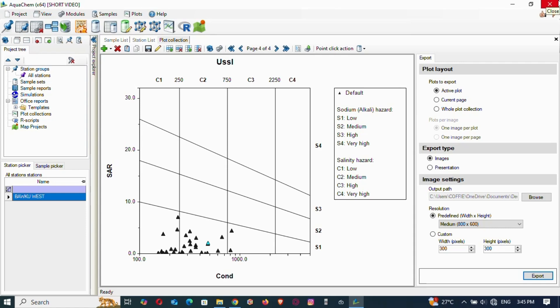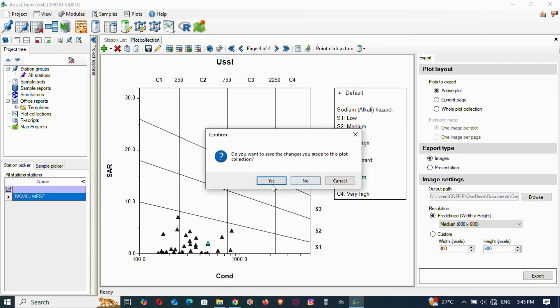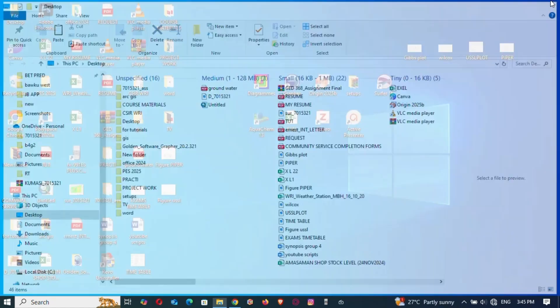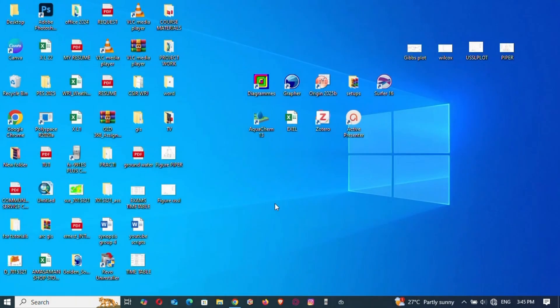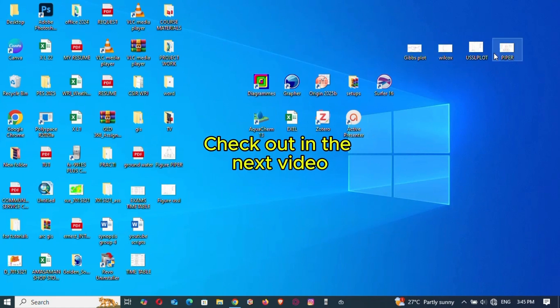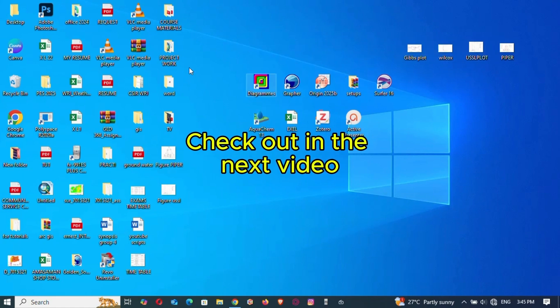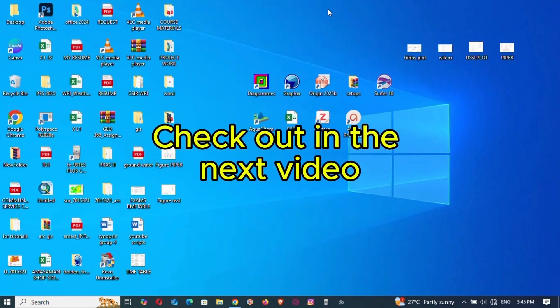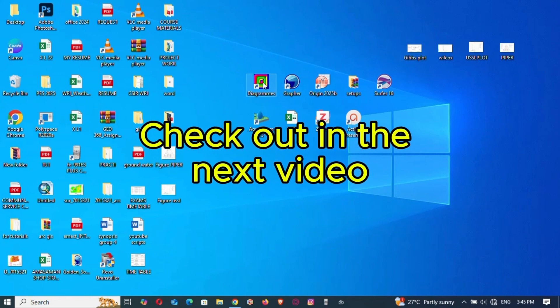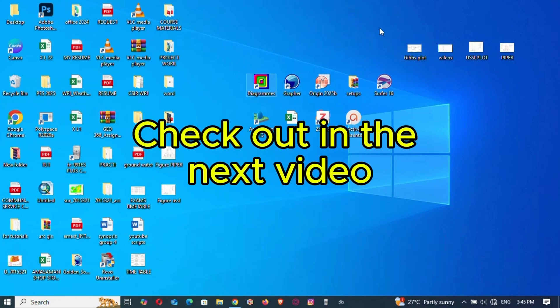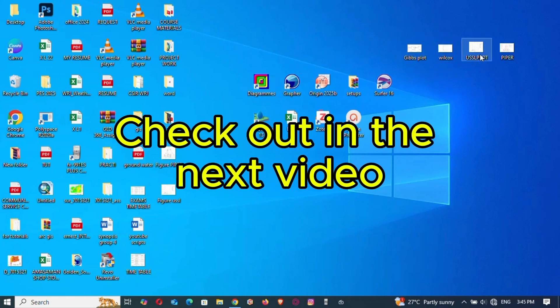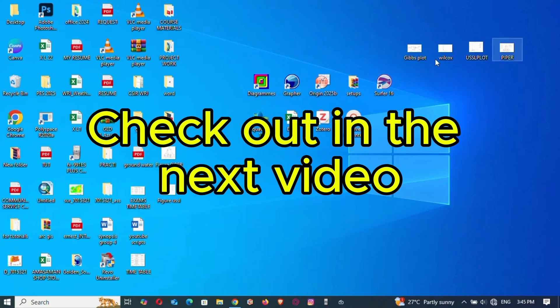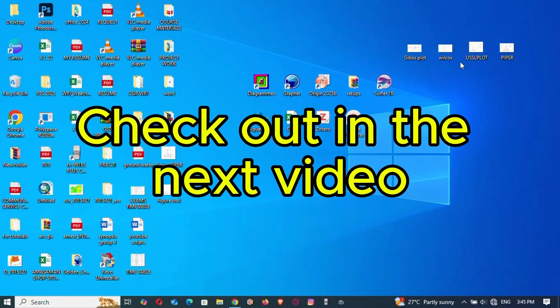Let's close this — no need to save. Now let's look at how to use the Diagrams software to plot these as well. We're going to look at how to use Diagrams to plot Wilcox, USSL, and Piper.